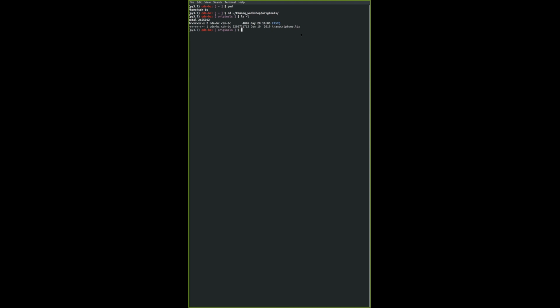We can also ls any other directory that we want, somewhere else in your file system or within this directory that we are in. So I'm going to ls fastq, which is again a directory, and it shows that we have several files in there. Two of the files are the fastq files, which we downloaded last 2 weeks. Again, for those who have not downloaded, please do so soon. We're going to use it very soon, and make sure that they are in the gzip format, compressed in the .gz format. If you have not, do zip it back to gzip, or re-download the two files, whichever is easier for you.